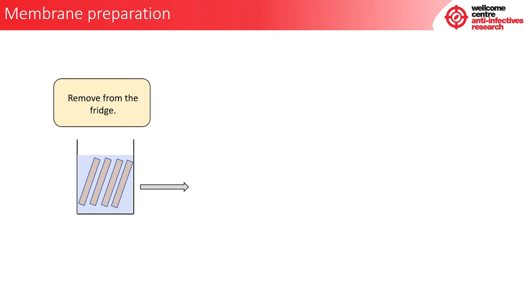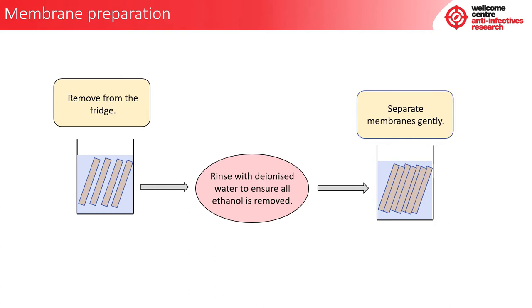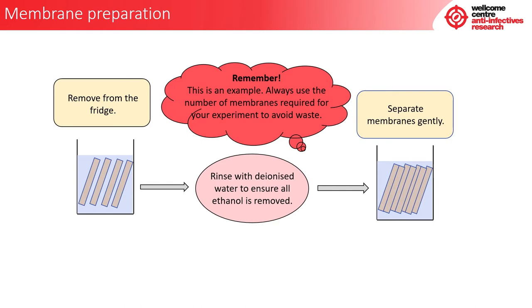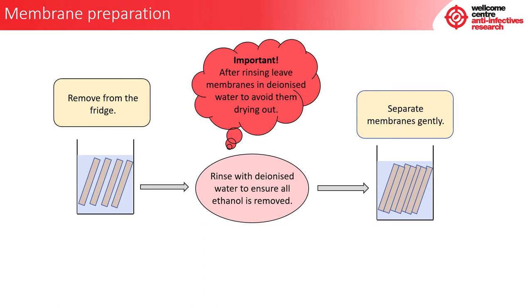Whilst the compounds and controls are equilibrating on the bench, the membranes and dialysis block can be prepared. First, remove the membranes from the fridge. Then rinse them with deionised water to ensure all ethanol is removed. Finally, separate the membranes gently and ensure that you have all membranes needed. It is important that the membranes are left in deionised water until use to avoid them from drying out.